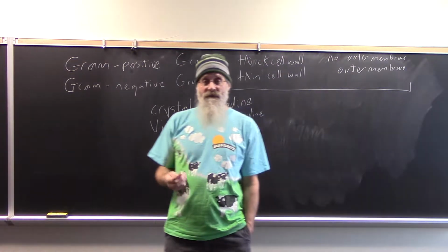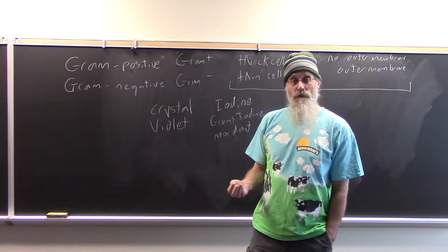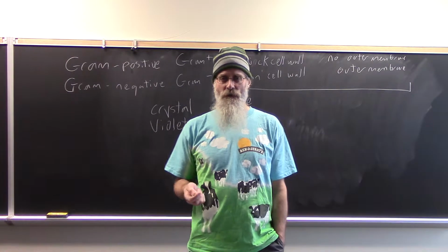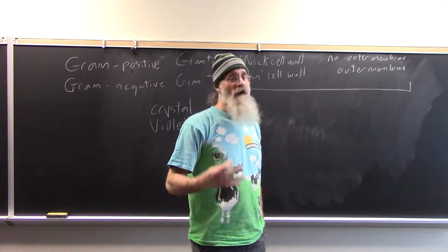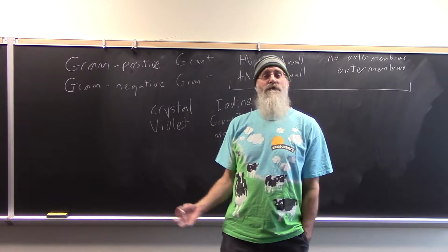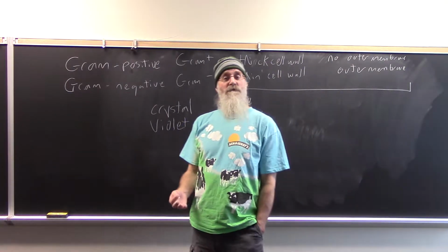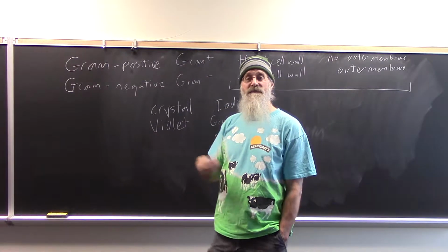And what happens is that you first, like you were simple staining, stain with the crystal violet, and then you wash off the excess crystal violet using water. Remember, you've put down your smear, you've fixed your smear. You've done so without an unbelievable amount of cells. Because if you do have an unbelievable amount of cells in your smear when you're gram staining, it's going to be very difficult to distinguish between the gram positives and the gram negatives.